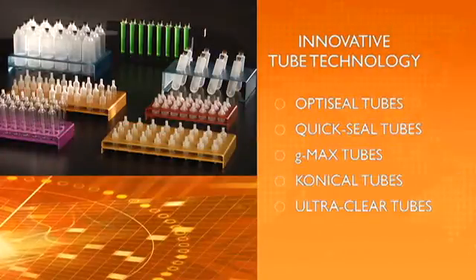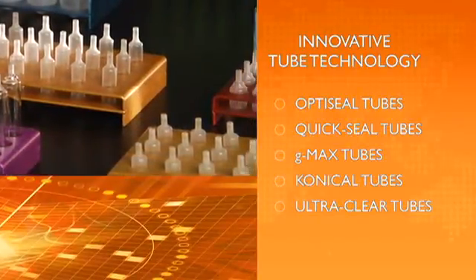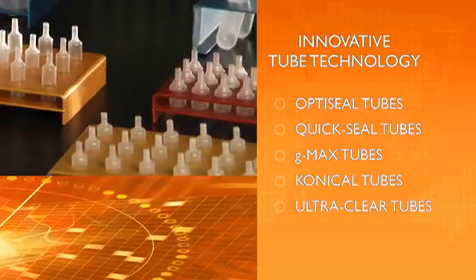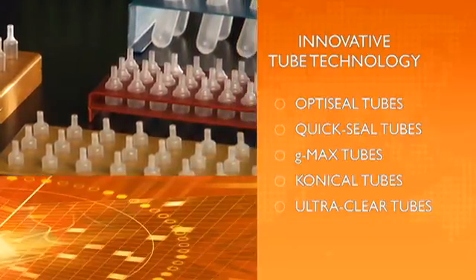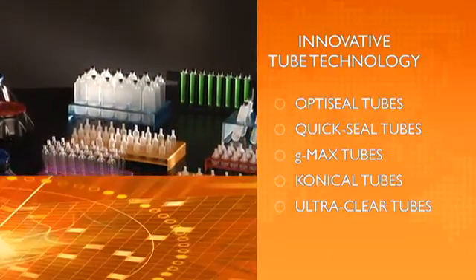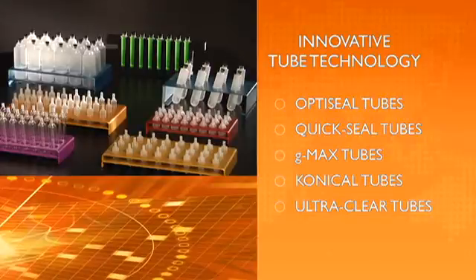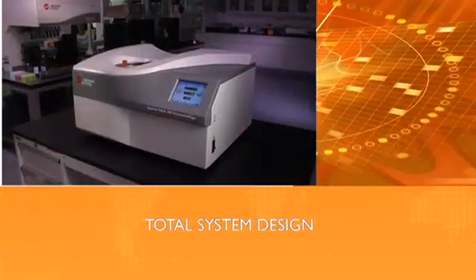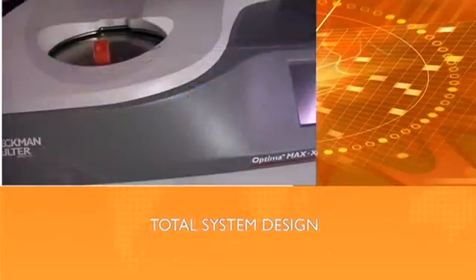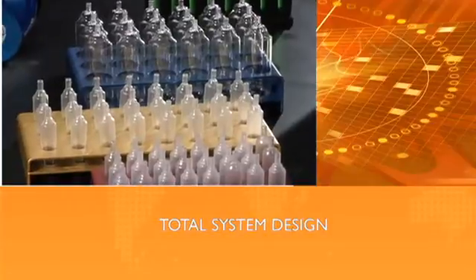Exclusive design features and Beckman-Coulter labware and accessories enable you to tailor your tabletop ultracentrifuge system to your specific needs. With a variety of innovative tube designs to choose from, our innovative tube technology offers the utmost productivity for a vast range of applications. The Optima Maxx series delivers a total system approach to your ultracentrifuge needs, including the instrument, rotors and labware to meet your lab's requirements.